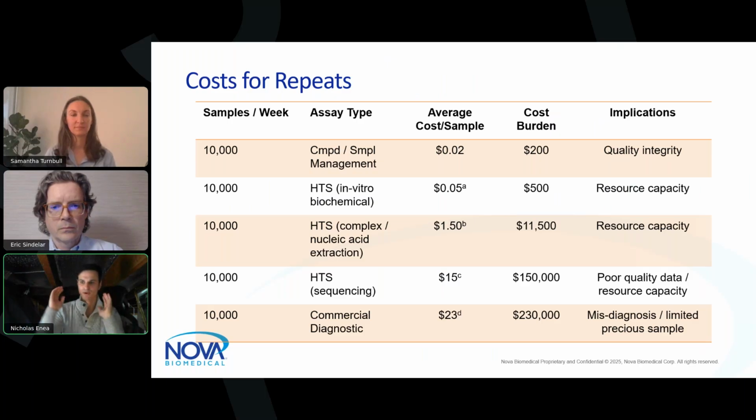One, Hamilton did a great job at saying how to optimize liquid classes. I kind of walk through, globally, why you do it as well. But ultimately, it comes down to costs, right? Liquid handlers are not cheap to run. The reagents, dependent on assay types, are not cheap to run as well.